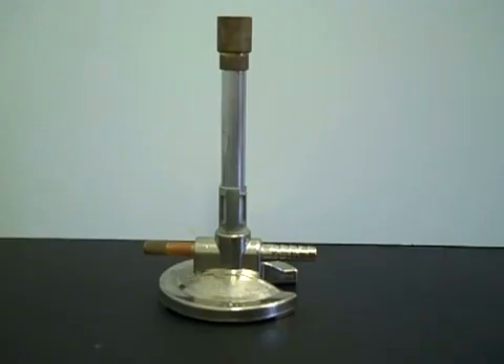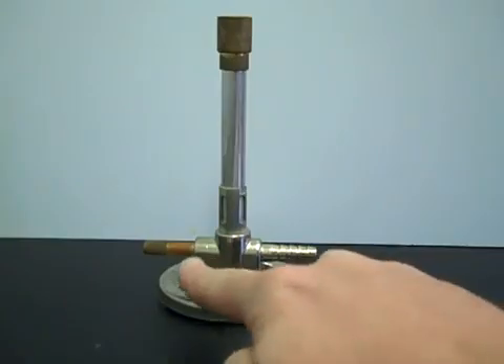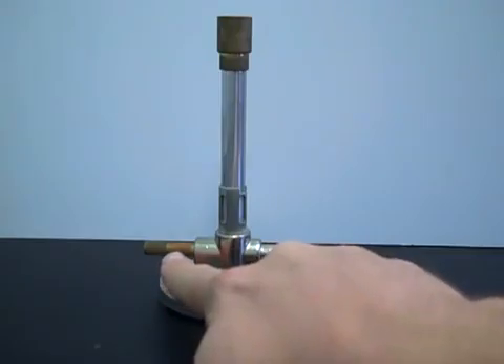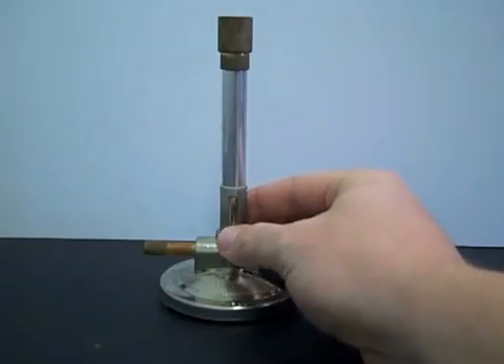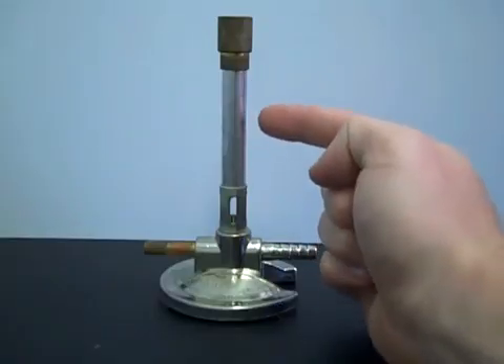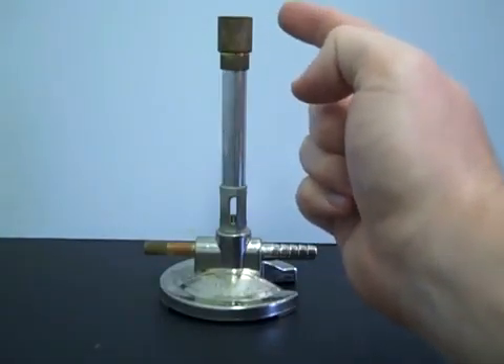The laboratory Bunsen burner is a common piece of equipment used for supplying heat in the chemistry laboratory. A conventional Bunsen burner has four main parts: the gas inlet, where the gas comes in from the main supply; the needle valve knob that controls how much gas is allowed through; the air vents with a movable collar to control the amount of oxygen mixed in with the gas; and the barrel, where the oxygen and gas fuel mix before being ignited when the mixture comes out the top.